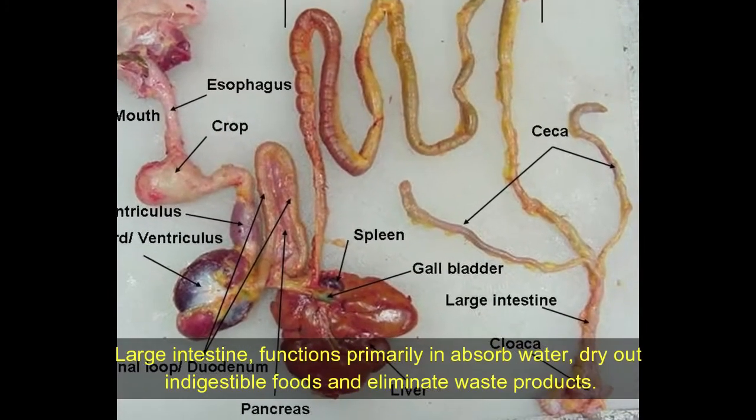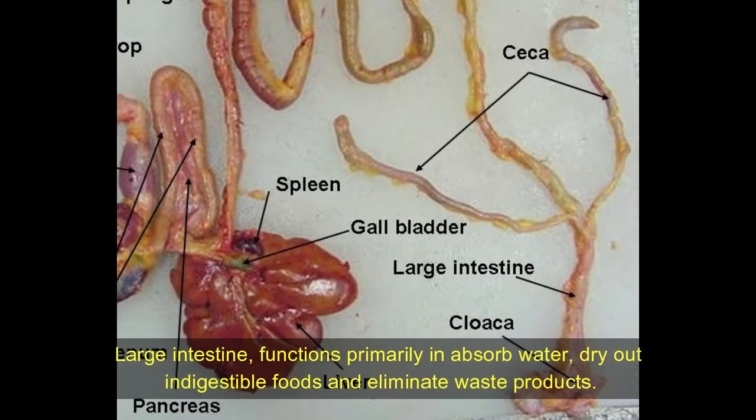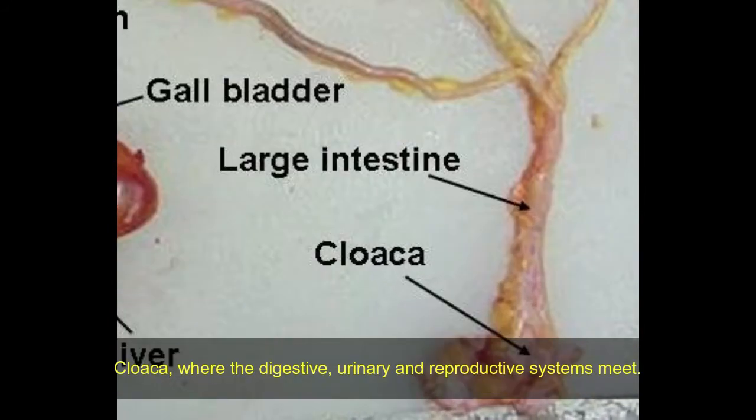The large intestine functions primarily to absorb water, dry out indigestible foods, and eliminate waste products. The cloaca is where the digestive, urinary, and reproductive systems meet.